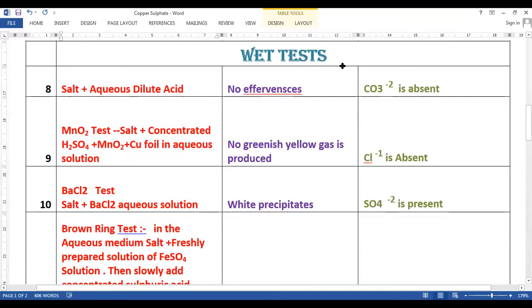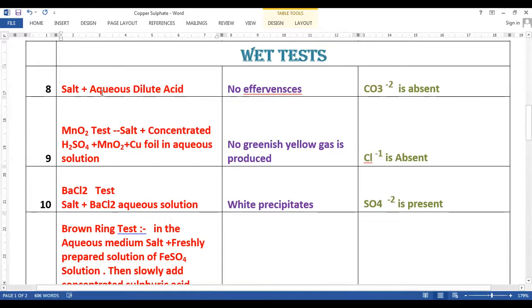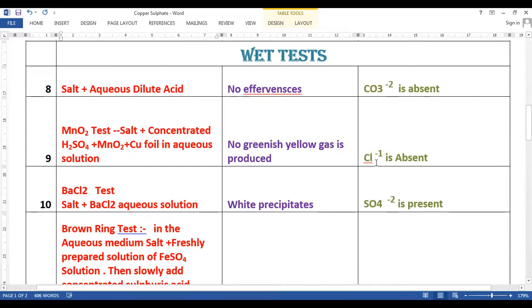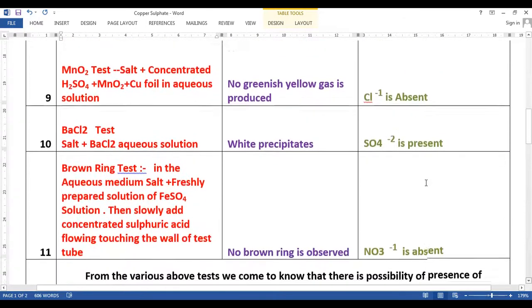Now we are going to observe the wet test. We generally perform this wet test for the identification of negative ions. We take this salt and add dilute acid to it — we do not get effervescence, and that is how we can say that CO₃²⁻ is absent. When we perform the MnO₂ test — taking the salt with concentrated sulfuric acid and MnO₂, using Cu foil as a catalyst and heating — we do not get greenish yellow gas, so Cl⁻ ion is absent.